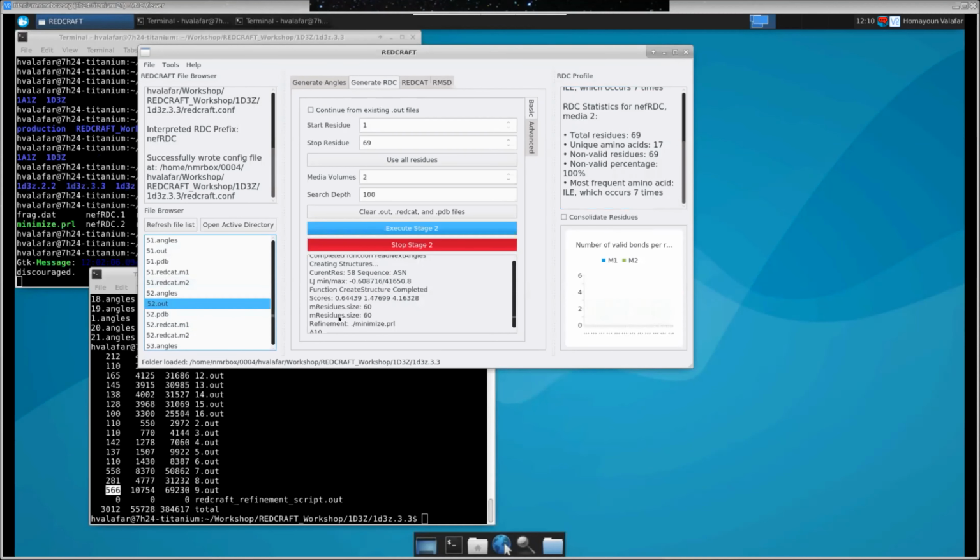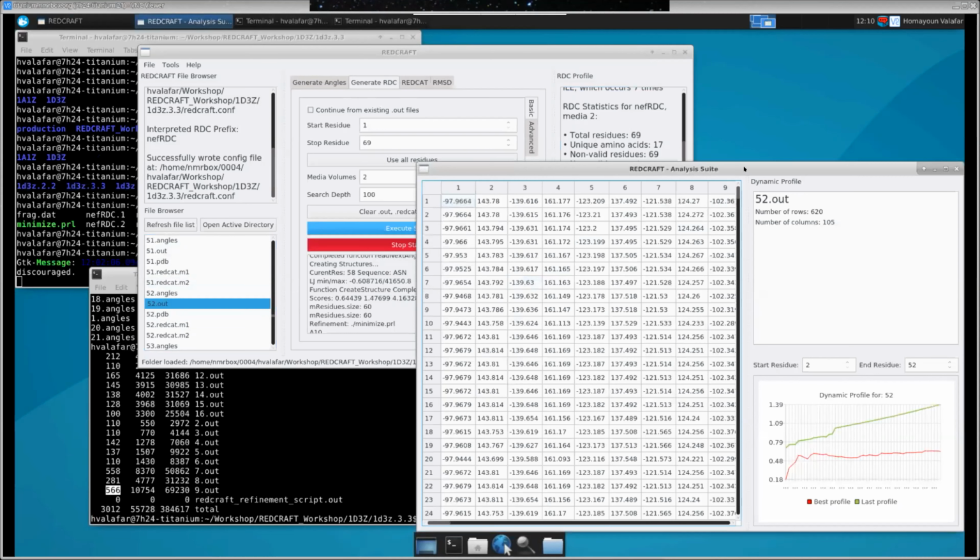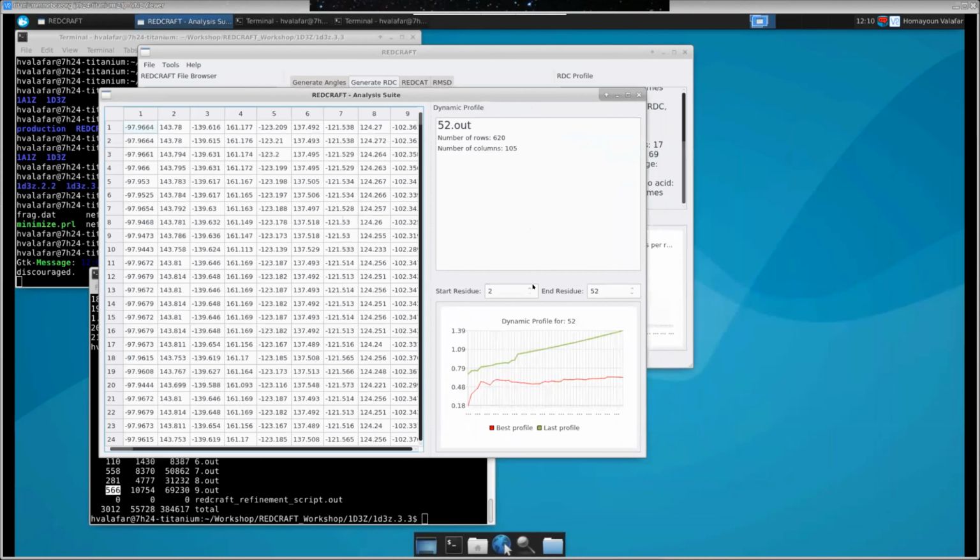So if that's not the case, that could possibly indicate problems. So you can see in here, yeah, a monotonically increasing profile, plateauing, and this marker basically is linearly increasing, indicating a healthy inclusion and evaluation of a healthy number of structures. If they are converging, it's not necessarily a good indicator.